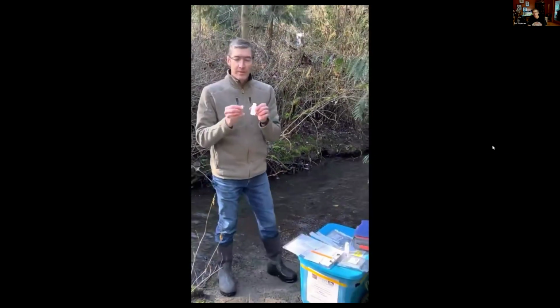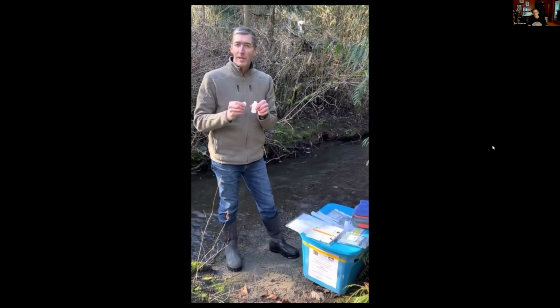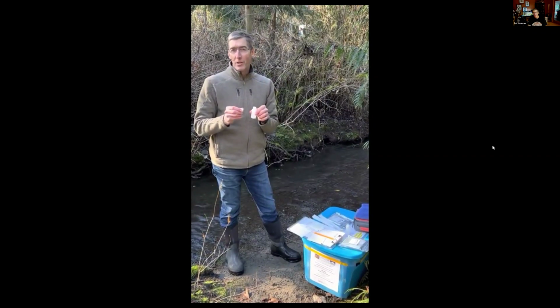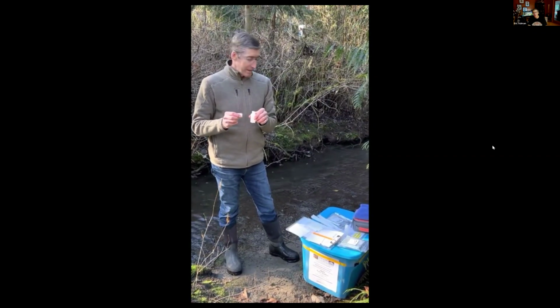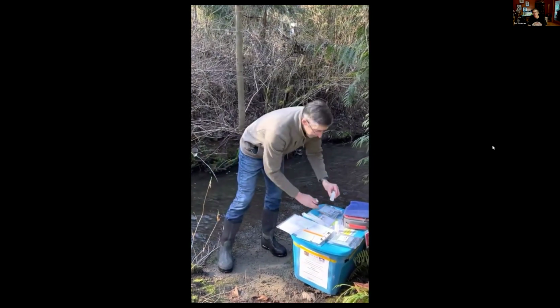And if I wanted to carry this sample back somewhere, like say to my vehicle or another location, I could put a cap on it, and I could then pipette out of this sample at a different location. So for your site, that may make it easier. In this case, I'm just going to put it on my box here that has my water monitoring equipment.